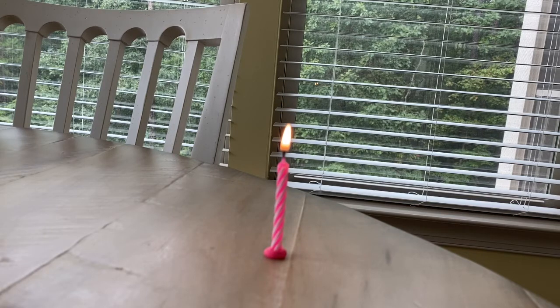Now set the candle aside and allow it to burn completely. Move on to the next procedure while the candle burns. When finished, be sure to record your final observations.